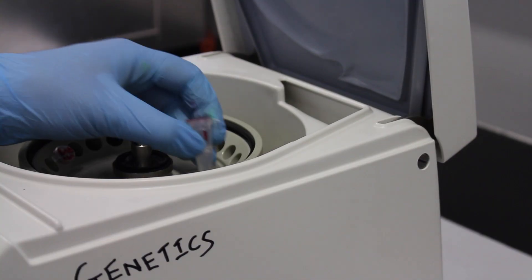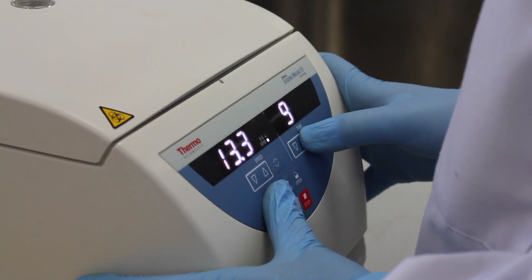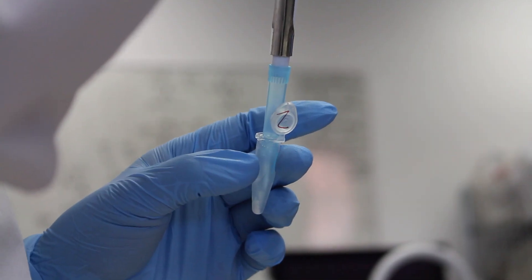The samples are transferred to the centrifuge and centrifuged at top speed for 10 minutes. The pellet contains all the cell debris while the supernatant contains the desired plasmid DNA.